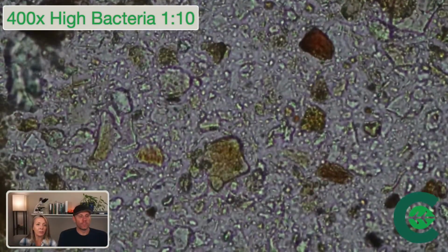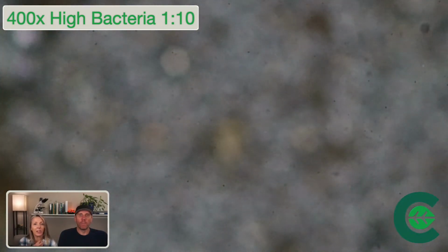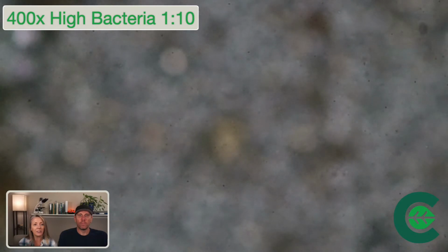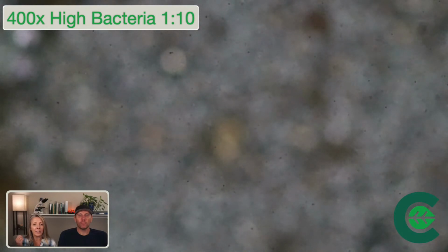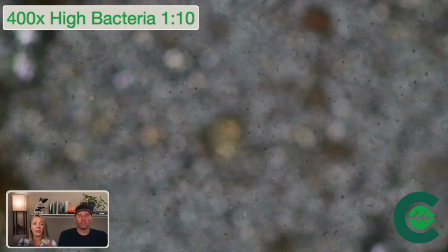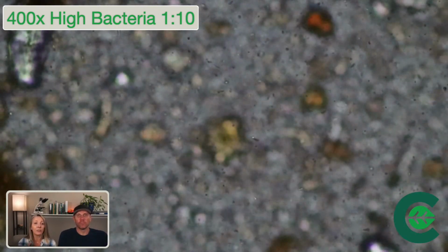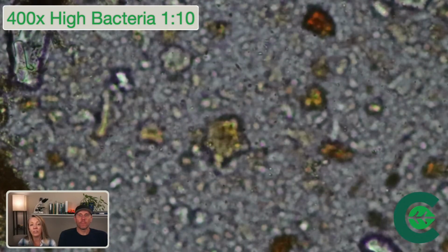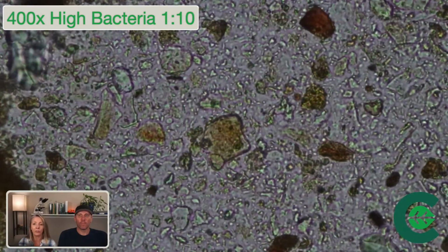We're moving to the next field of view. So in the next field of view, we're going up to the top of the sample again. We're going to scroll all the way on down through it. You'll get to see what bacteria is there. I'm mentioning the bacteria because it is actually important to identify what bacteria are present. What are the shapes and what are the different sizes? That tells us diversity of bacteria. That tells us whether we're increasing or decreasing in diversity, the robustness of the living soil system.